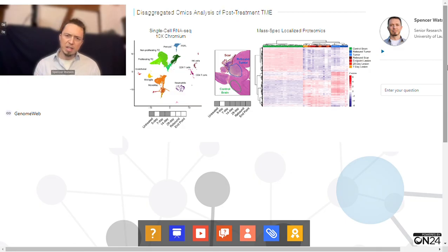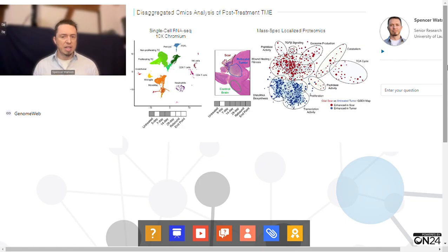treatment. And we next did a very large-scale mass spec proteomics study where we also did manual microdissection to isolate individual regions from within each section so that we could pool these together across each of the time points and then do mass spec-based proteomics. And this was very useful for us because if we were doing, say, GSEA analysis and aggregating and clustering all these different enriched pathways, we could compare not just between different time points, but between different regions of the same time point. And while both of these were useful, they are still largely just disaggregated data. So they really lack the single-cell spatial resolution that we need.